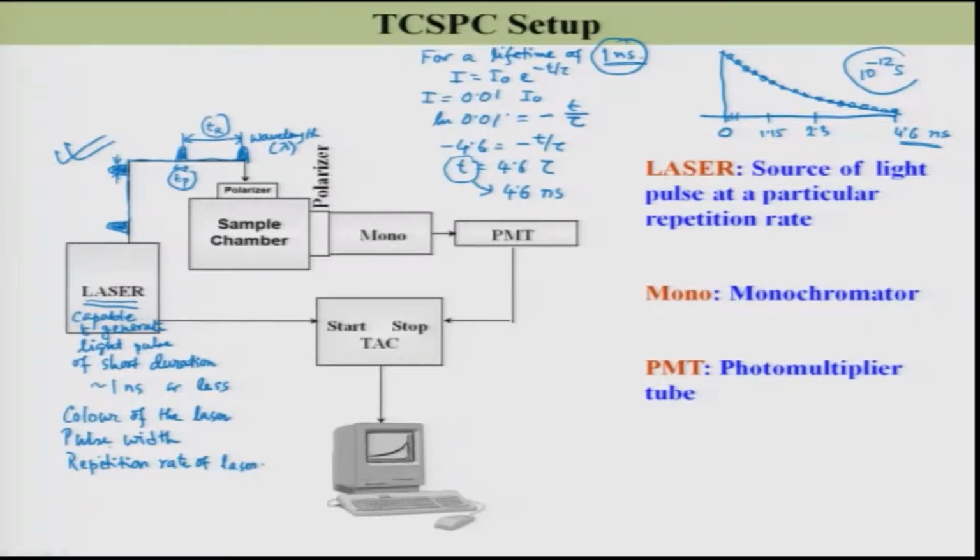Okay, so these three properties I need to look at. Now, let us see that these pulses are coming out of this laser, and eventually it will excite your sample.